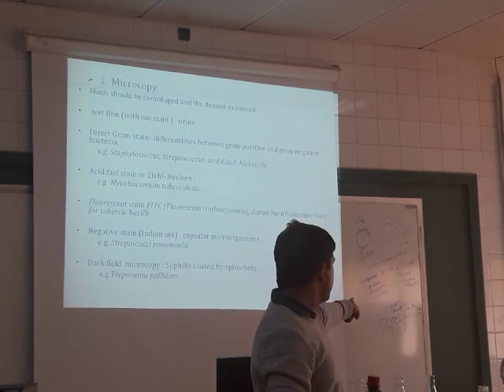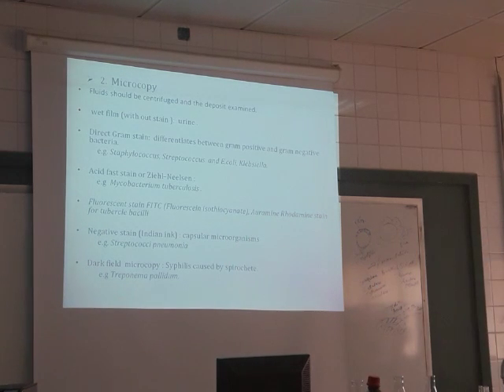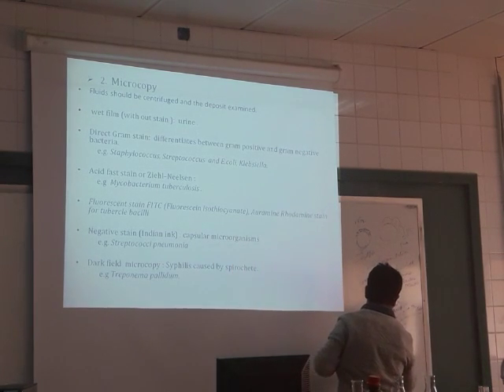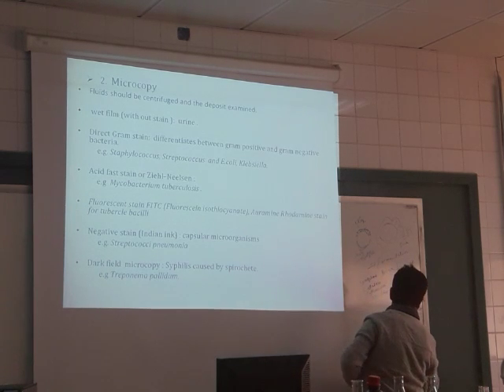So this microbe has a fatty acid here. And if you do the Gram stain, the fatty acid will not accept any kind of stain. It needs another special stain. It is called the Ziehl stain. What is Ziehl? Ziehl is the name of a person, and Neelsen.